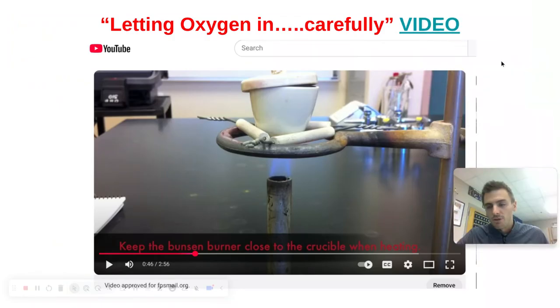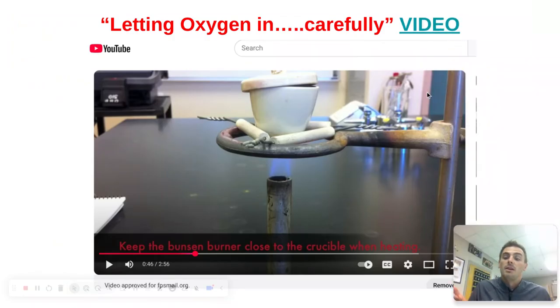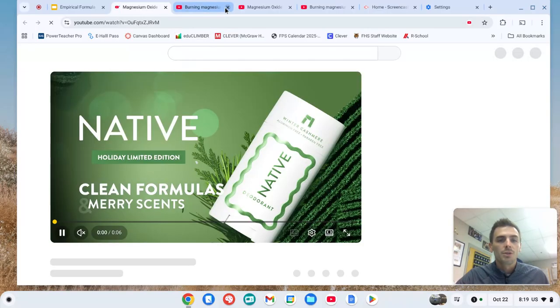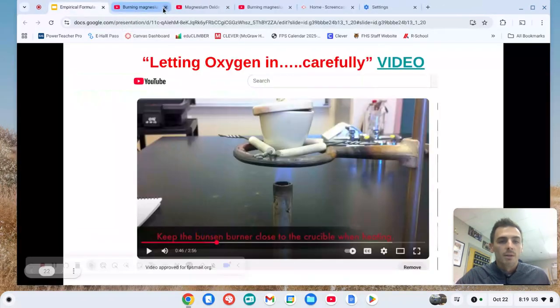Otherwise, as you read through the lab, it'll say that at some point you have to take the lid off. Now, like I said earlier, you don't just want to take that lid off and see your product going up into the air. You just want to take it off, and a lot of times what I'll say is tip the hat off just a little bit, like a kid who barely wears their hat on top of their head. Now when it does that, you're going to see something on the inside that I hope you all will get the chance to really see tomorrow. So when you go to do that, everyone, I already had one pulled up.